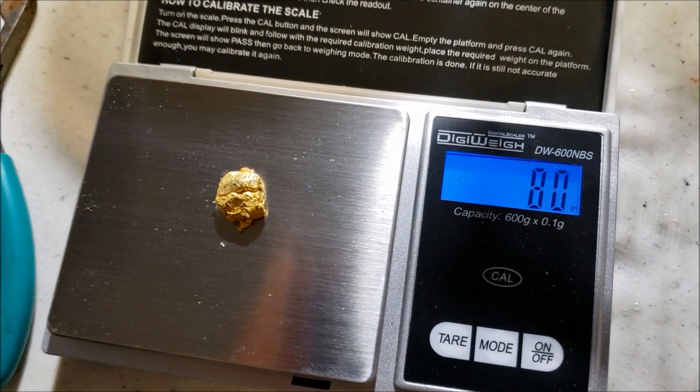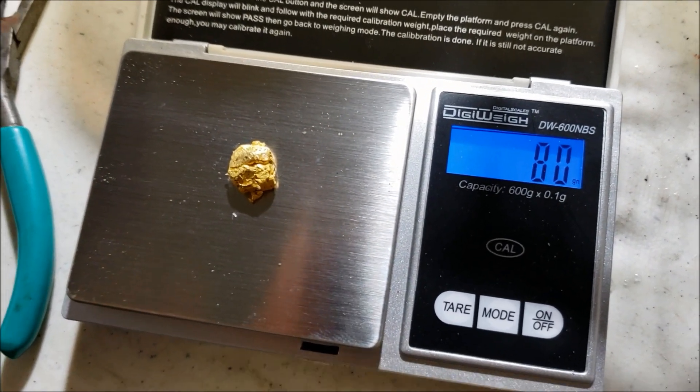But there you go folks. Oh, it just jumped to 8 - oh cool, 8 grams! It's growing. We'll call it at that.